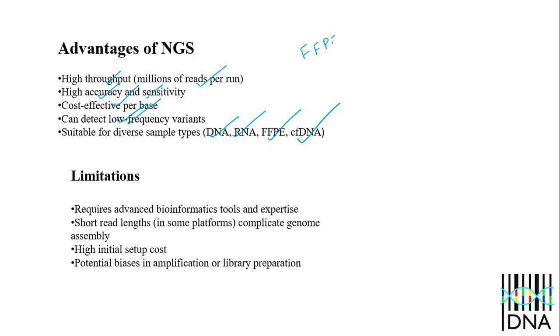FFPE means formalin fixed paraffin embedded DNA.